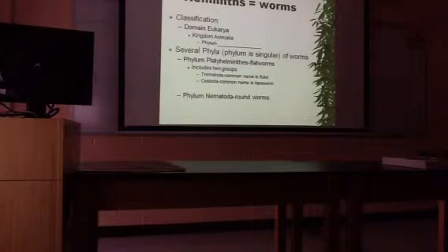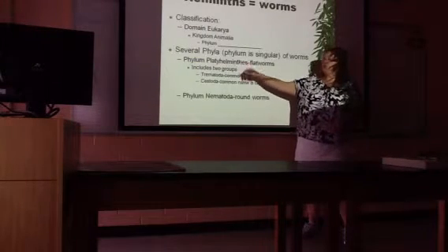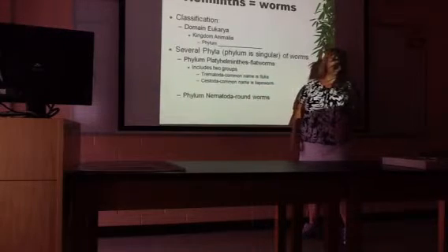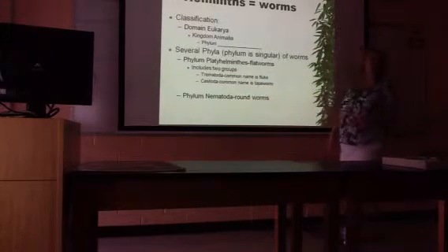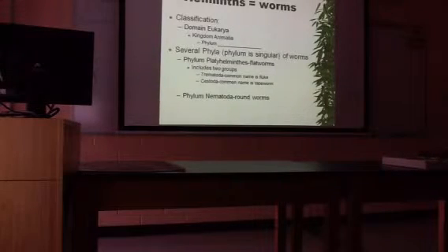What I want is for you to be able to identify the phylum that worm belongs to and which group it's in. Trematoda, Cestoda, or it's in phylum Nematoda. So only for lab 5, you don't have to identify them by their specific scientific name. You need to identify them by their group. So I'm going to tell you what group they're in. You're all on page 41.